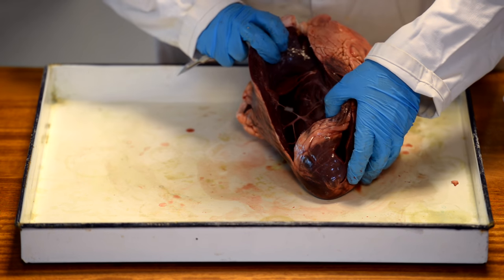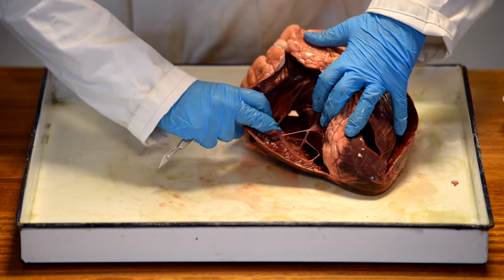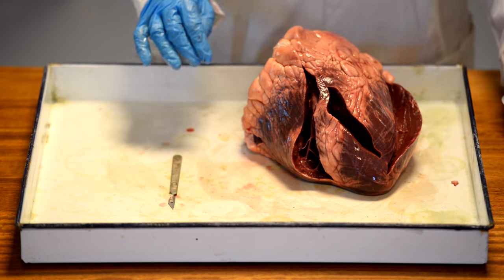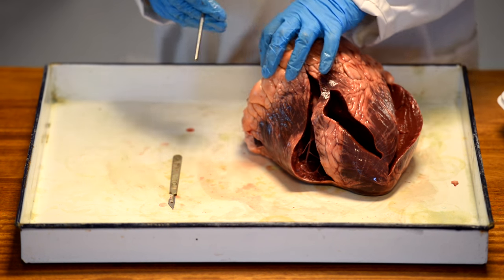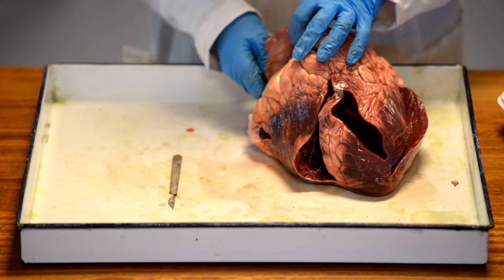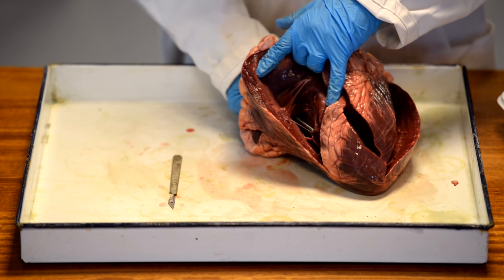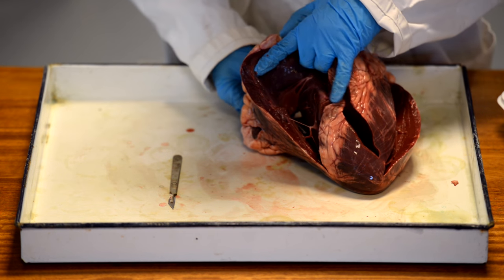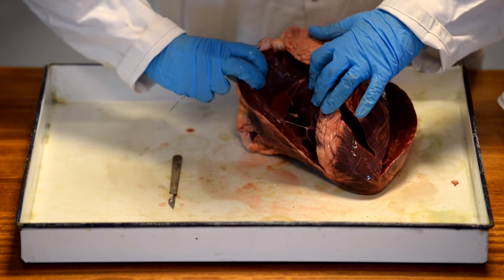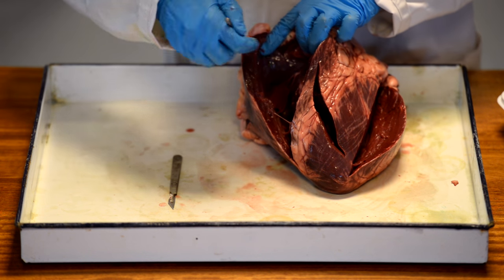So now, beginning to see what's going on inside the heart. So let's concentrate on the right-hand side. Remember, this is the weaker side of the heart. And I'm going to get a mounted needle, very useful for tracking the pattern, the route. I'm going to go in through the right atria, and you should see that I have now peered into the right ventricle. So the mounted needle has come through this set of tissue.